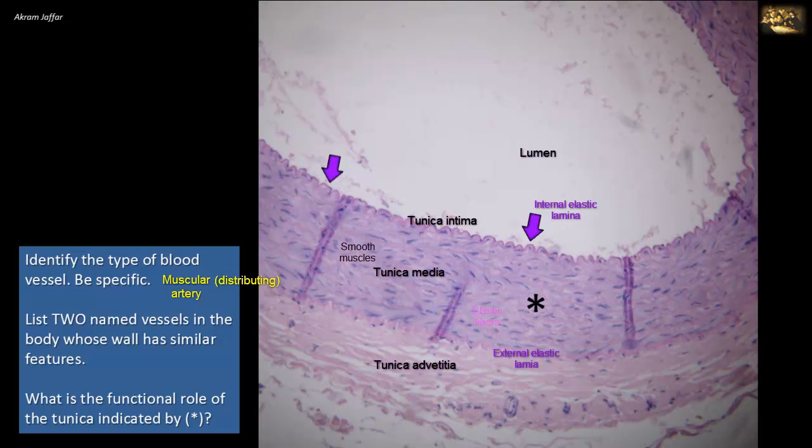It should be mentioned that the internal elastic laminae belongs to tunica intima, and external elastic laminae belongs to tunica adventitia. But some textbooks associate them with the media. Also note that the dark lines shown in the section are artifacts due to folding that took place during tissue preparation, and they are not a distinguishing feature by any sense.